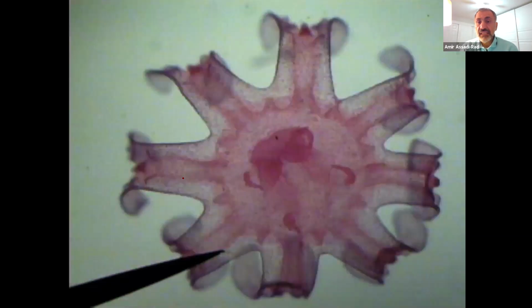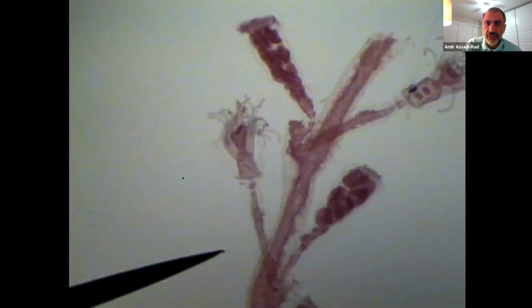This is your Ephyra from class Scyphozoa, and this is from Aurelia. The name of the organism is Aurelia, class Scyphozoa, and phylum Cnidaria, of course, and the name of the structure, the larva stage, is called Ephyra. And then you have this in the lecture.